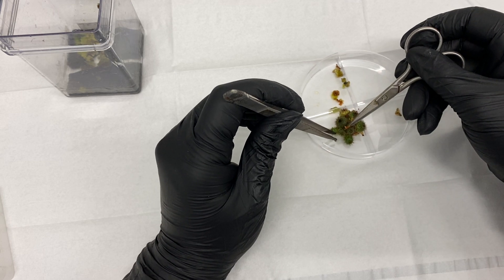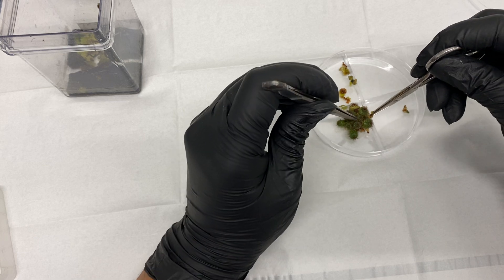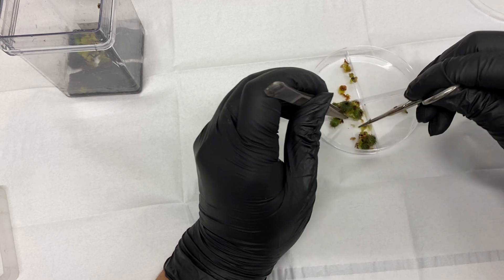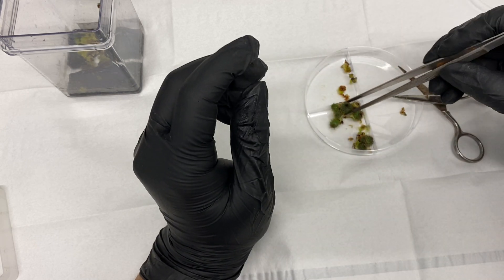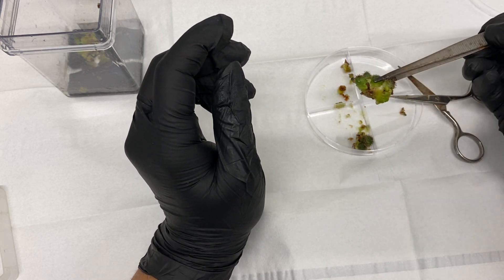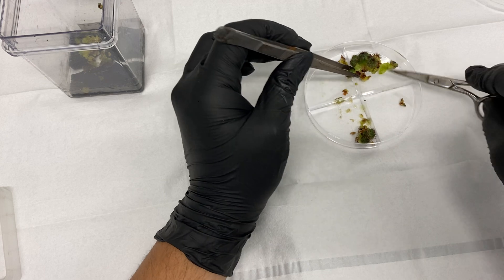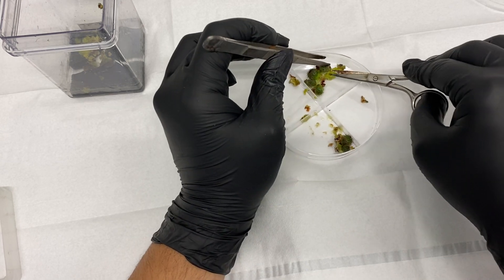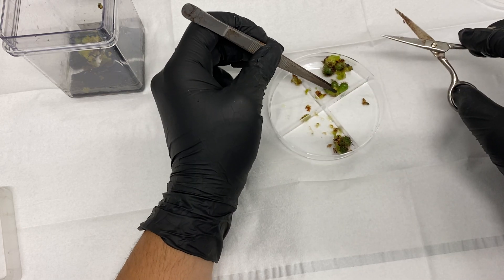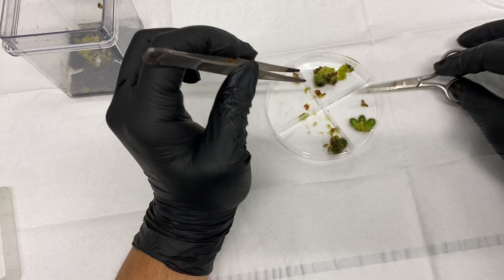It's actually stuck together, so I'm going to have to break the bunch, going naturally wherever it wants to break — just going in at the center. Wow, it's very compact, I was not expecting this at all. It does actually seem to be a multi-headed cluster. If you could root that main base you could have a multi-headed Frailea plant, which would be pretty cool. But we're going to go ahead and separate them out — I'll keep them in tri-bunches, three per each one, since we have nine.